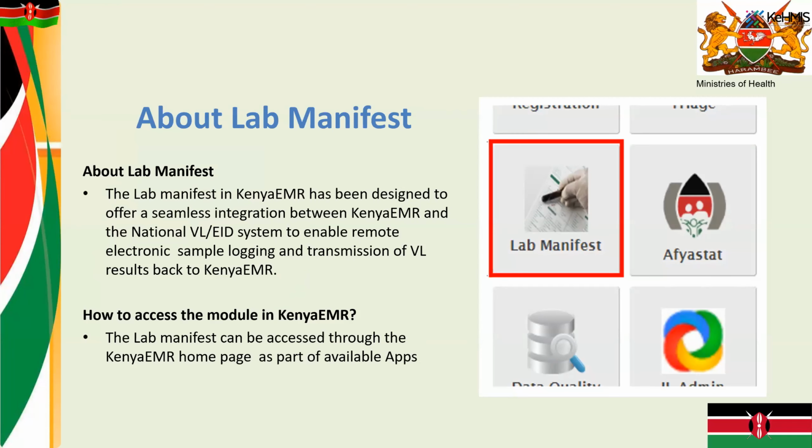Yeah, so just to begin about the Lab Manifest. The Lab Manifest is one of the modules in Kenya EMR that has been designed to offer seamless integration between the Kenya EMR deployed at the facility level and the national VL EID platform, to enable the remote electronic logging of samples from the facility to the reference lab for the purposes of testing.